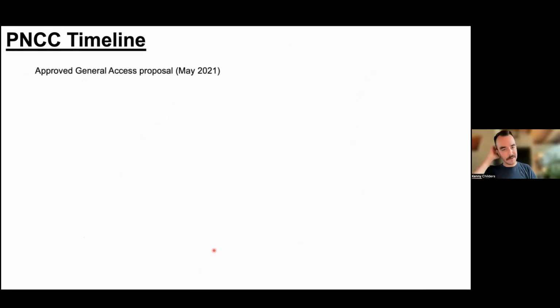So back in May 2021, in the midst of the pandemic, Clint, my PI, and I started talking about incorporating cryo-EM into our research. He told me about PNCC, and together we wrote a general access proposal, which granted us 2 years of time at PNCC, where we could send samples, work with them, and hopefully get a lot of great data. So we got it approved in May 2021.